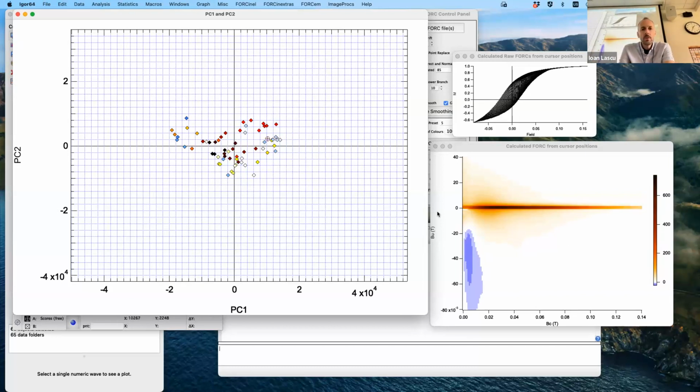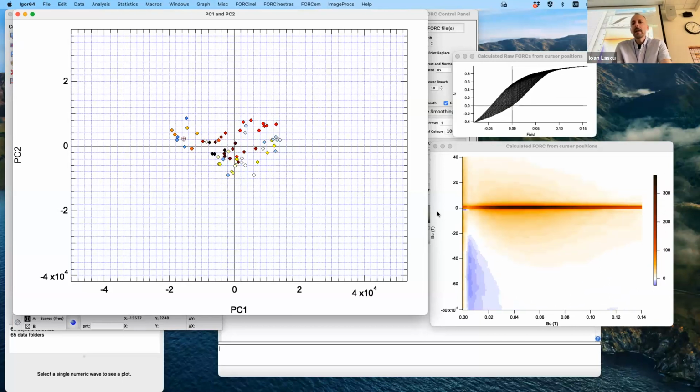And as we move to the other end of PC1, I'm not going to do it, but I could plot the central ridge distribution of coercivities, and you'll see that it actually is going from having its maximum around 20 or 30 all the way to over 100. So the main variability in the data set is described by this change in the central ridge, the maximum coercivity, going from a component that is biogenic soft to a component that is represented by biogenic needles in this particular case.